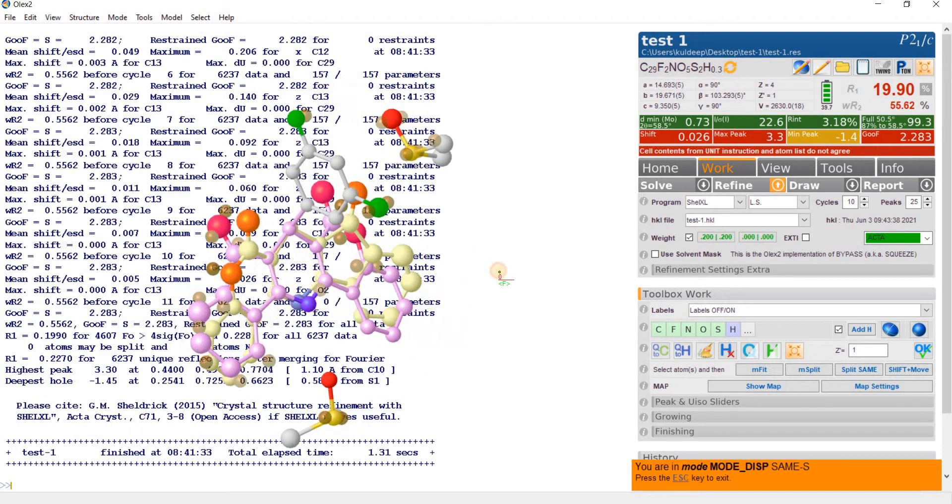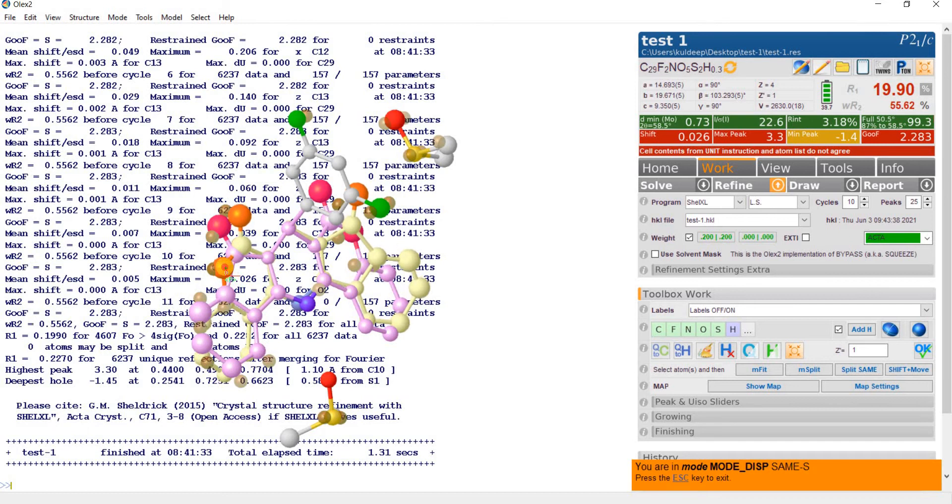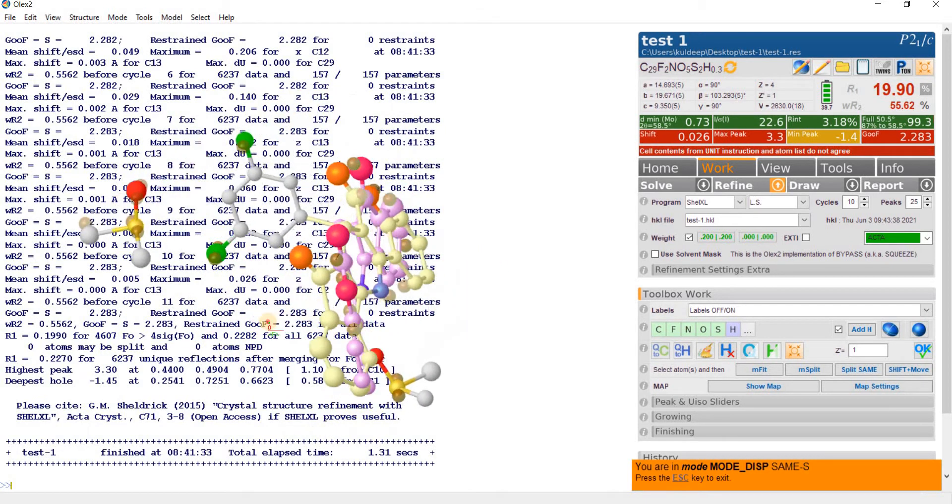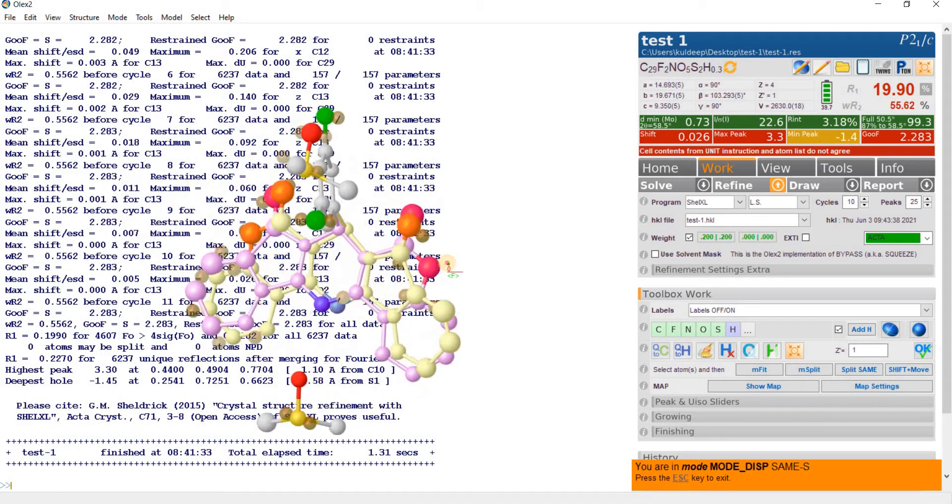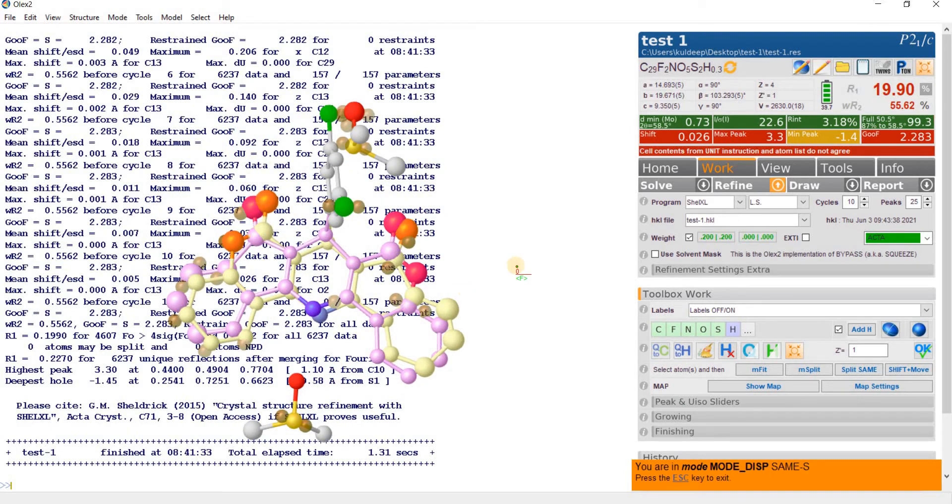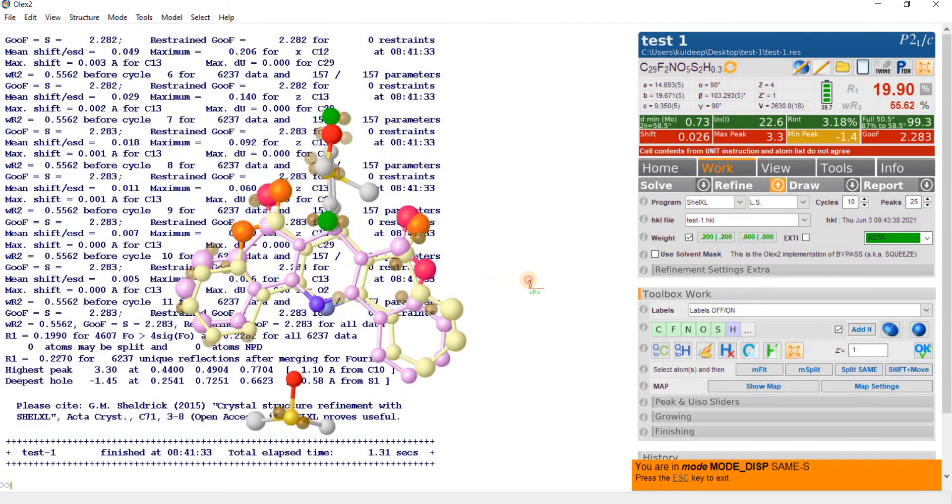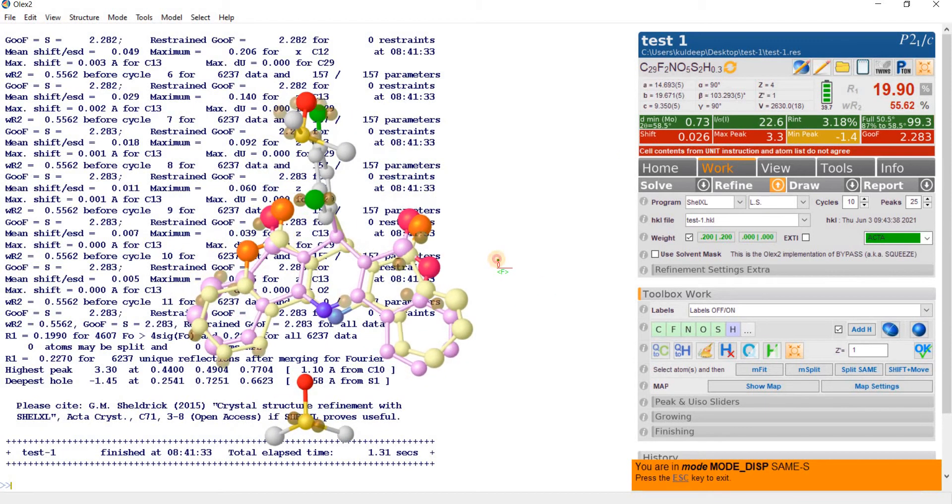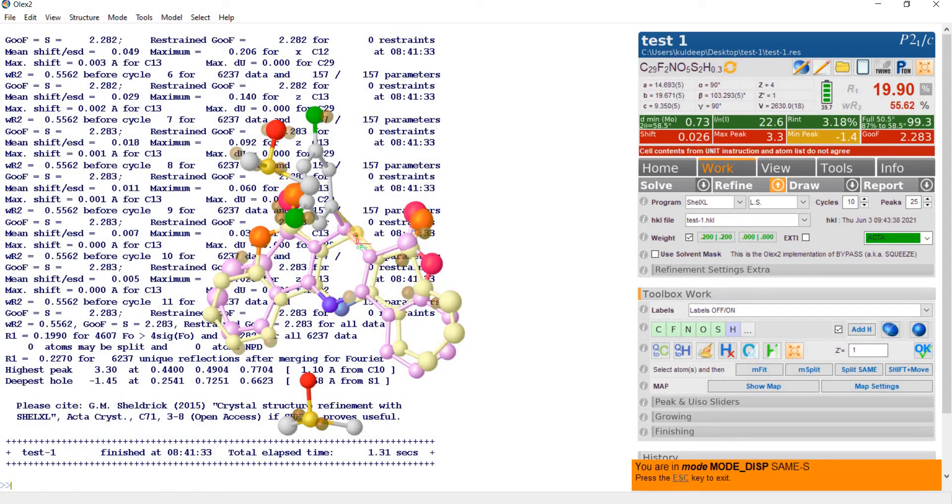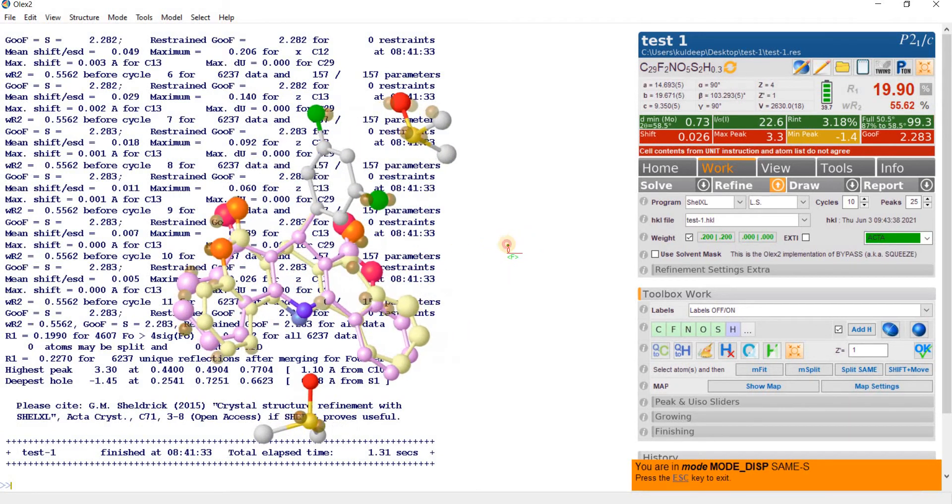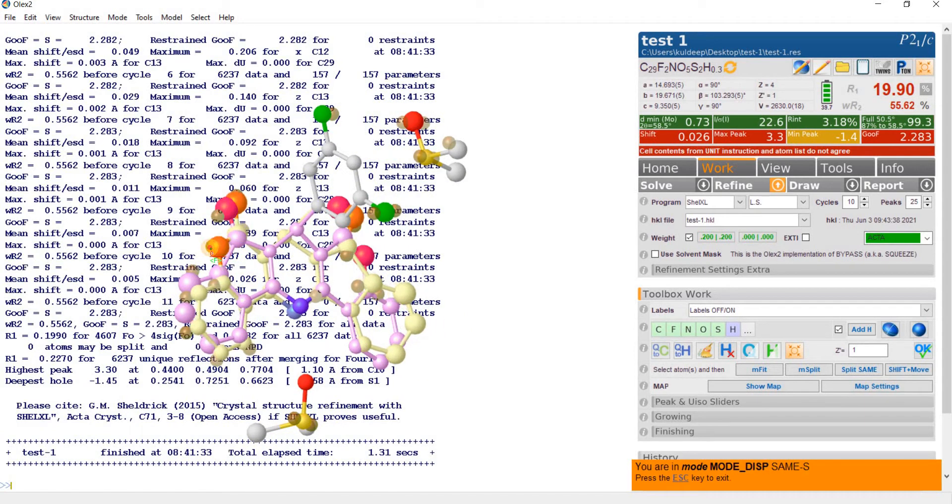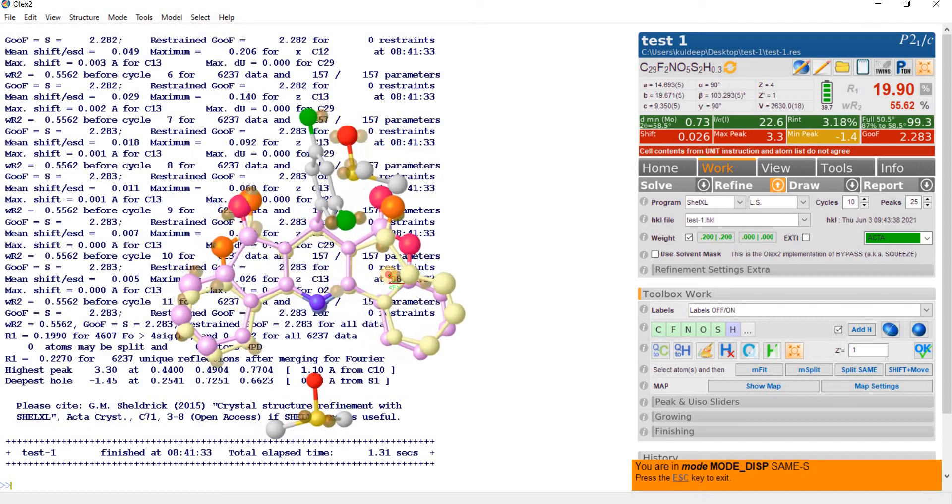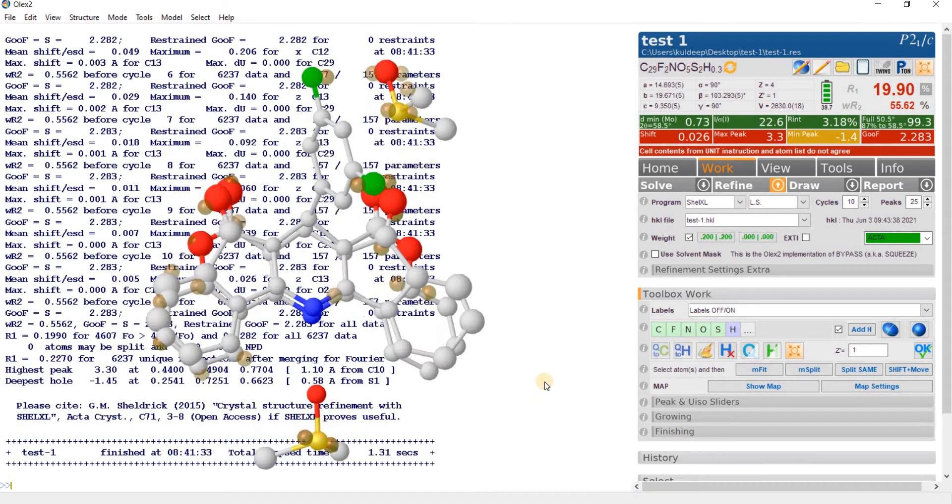Now rotate this part 180 degree to the first part and you will make a situation like this. This oxygen should cover this Q peak. Now it seems reasonable. Now it is quite good looking. Now press escape.